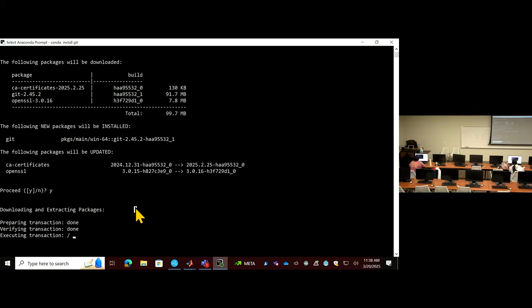Yeah, you're already done. So now you can copy the next, this line, the whole line. Then just put it in there and just wait, then you are done. Okay, so have you finished? Yeah, so you're running the installation. That's right.